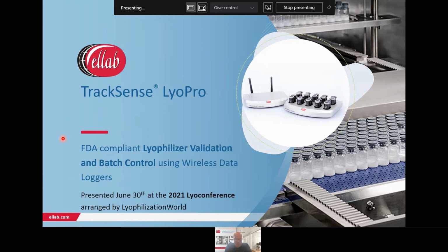My plan here is to take you behind the scenes, explain to you and share with you some of the considerations that we have had with our designs of freeze drying related equipment, and definitely talk about and share with you some of the challenges we have seen, especially in the pharmaceutical business with these freeze dryers that have the automatic loading and unloading systems, where it all gets very complicated, at least challenging, to measure temperature and other parameters in these units, because it's all under sterile conditions, all under class 10 or whatever conditions. So it really gets more complicated than ever, also for us as manufacturers. So we will go through this presentation, and I hope that it will work for us.